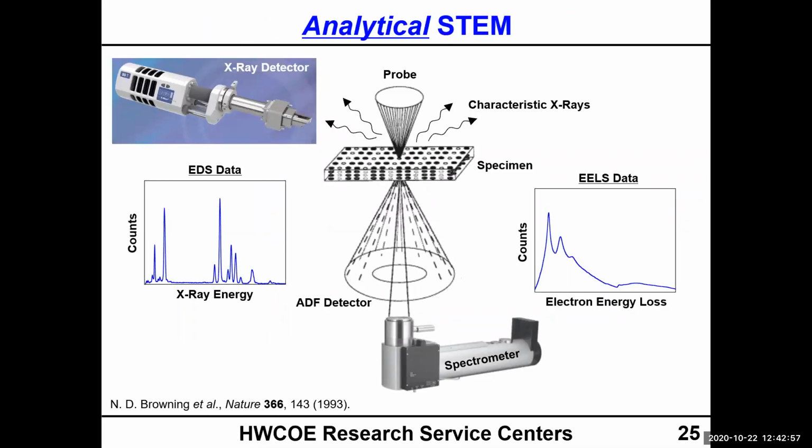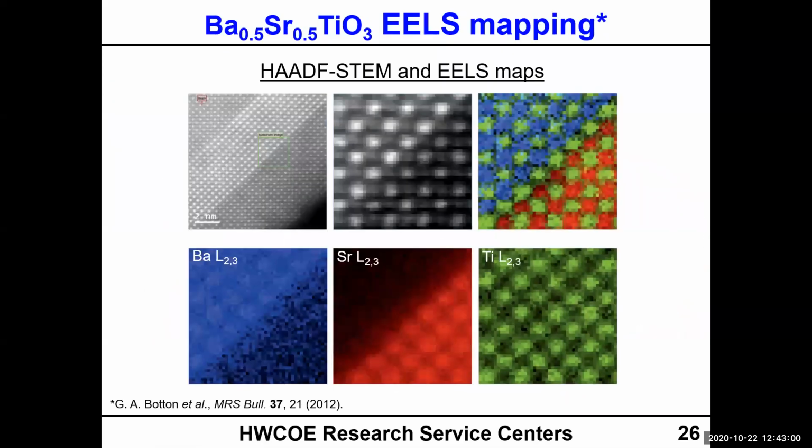And then, moving on to the other half of this, which is the EELS, we can do something similar to what we did with the EDS mapping, in that we can do atomic mapping. But instead of using EDS, we're using EELS. So we have another perovskite structure here, which is barium strontium titanate. This is actually some interface right here. Again, you can see the STEM image. You can see clearly I have some darker features and some lighter features. But then I can map barium, strontium, and titanium here, make a nice overlay like this, and I can clearly see that interface between the two.